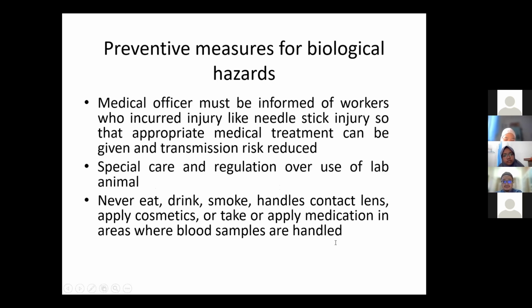In the case of an event, like injury due to a needle stick, appropriate medical treatment should be given and transmission risk reduced, maybe with prophylactic treatment. Those involved in the injury must inform their officer as soon as possible.